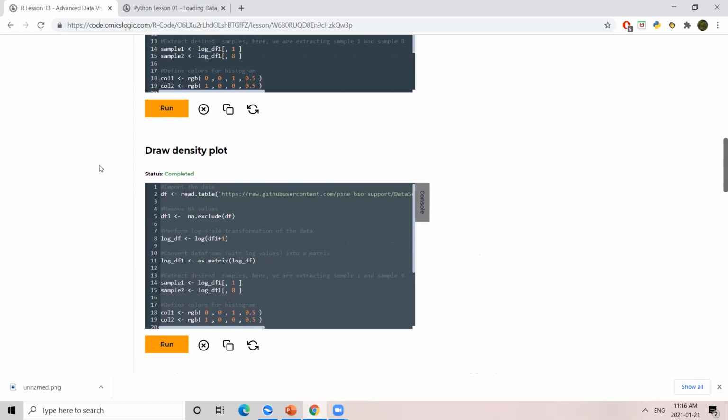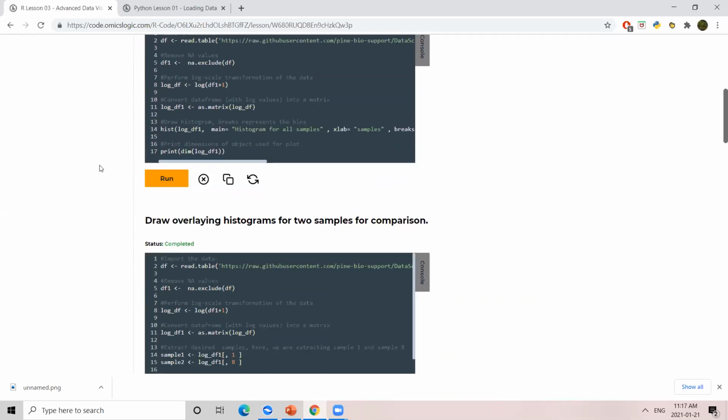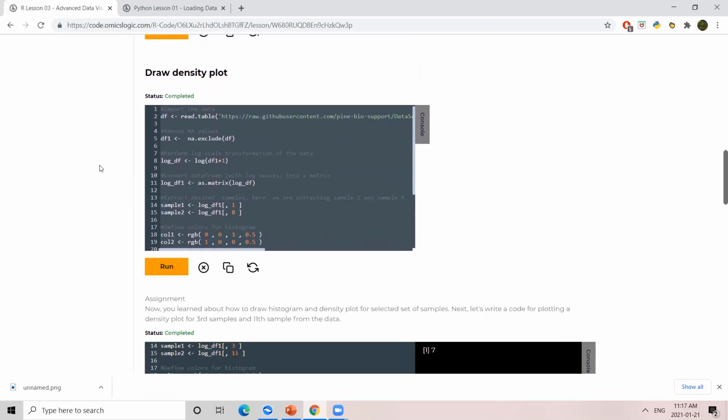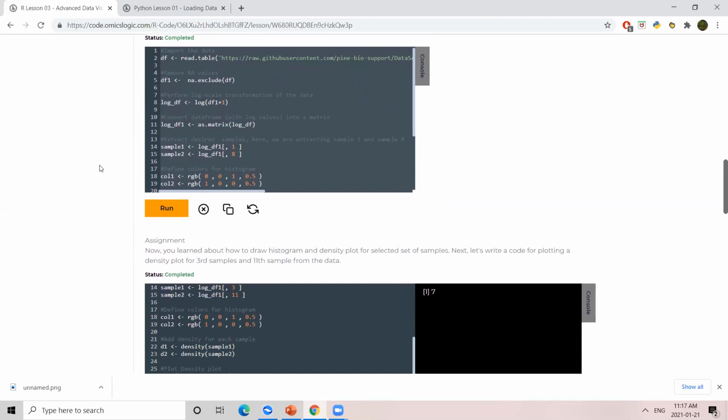Yep, you have to create a density plot, histograms. So just to clarify, the reason why we want to look at these different types of visualization is because we have a way to plot one single variable, for example, gene across samples, or we can combine all the data in our samples. For example, all the genes together, you can visualize as a density plot or a histogram.